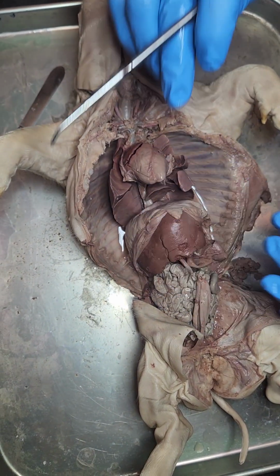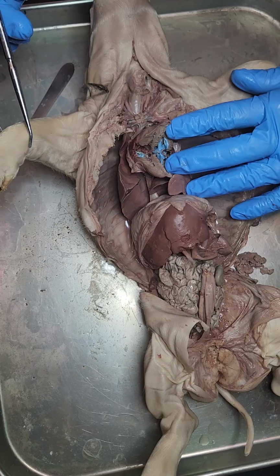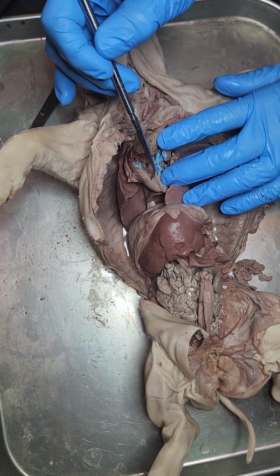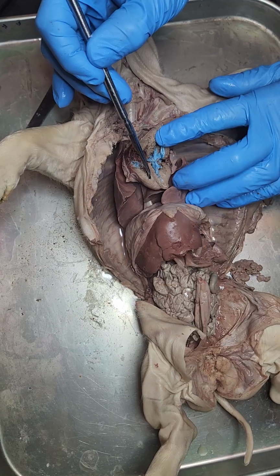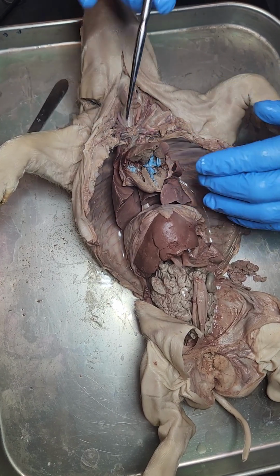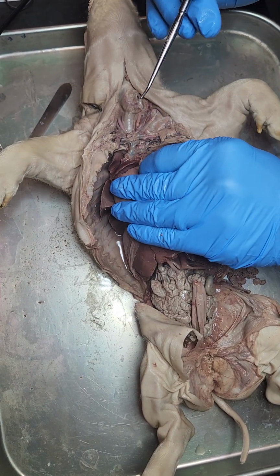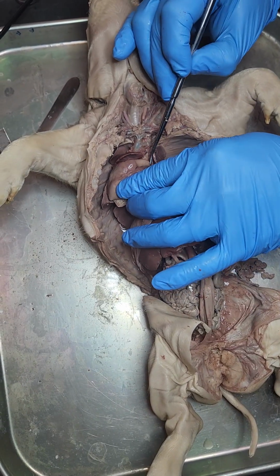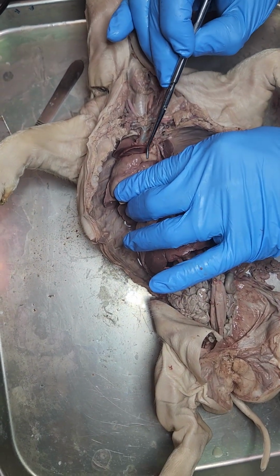So right atrium is next. We're going to open up the heart. It's the pig's right, so that'd be the right atrium. Then the right ventricle is just posterior to that, so that'd be the right ventricle. It's this chamber. And then we have the pulmonary artery. So we're going to say pulmonary artery or pulmonary trunk. Either one of those is okay. And we're going to look right here for pulmonary trunk. So we'll count that as the pulmonary artery.